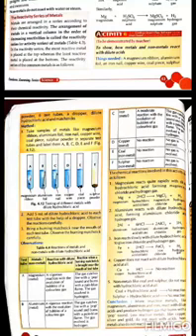Things needed for this activity are a magnesium ribbon, aluminium foil, an iron nail, copper wire, coal piece, sulfur powder, 6 test tubes, a dropper, dilute hydrochloric acid, and matchsticks.